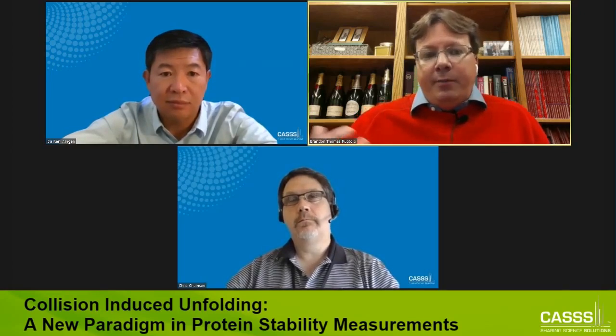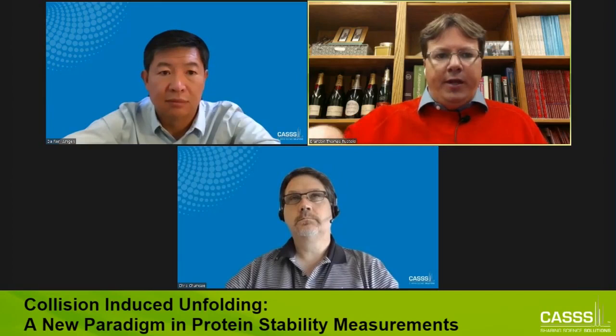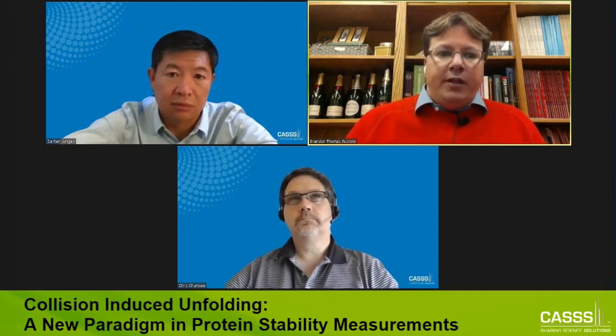Yeah, we would love to see it move in that direction, to be honest with you. As part of our partnership with Agilent, we have in the lab here a RapidFire 400, if you don't know that instrument platform. It's one of these devices that you can use to address a multi-well plate with a robot, and then aspirate those samples and directly introduce them into the instrument for rapid analysis.